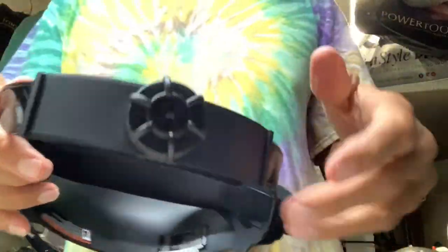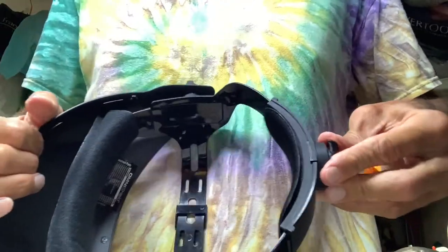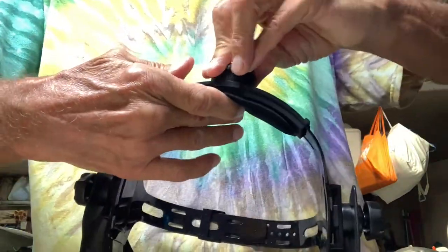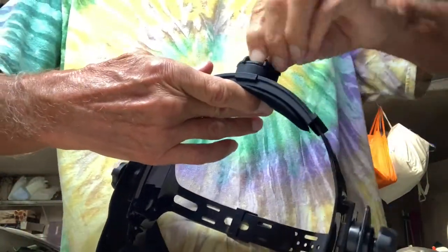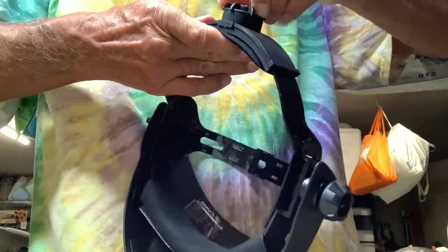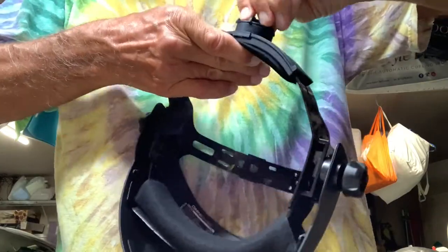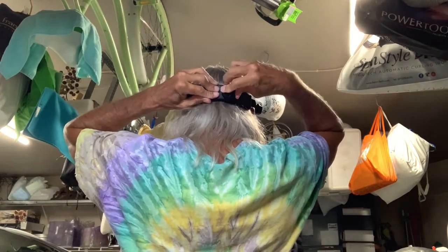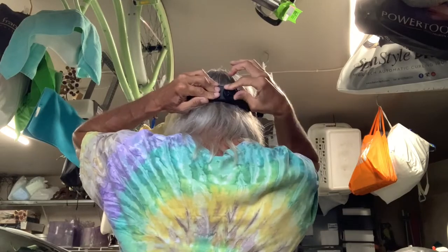Let me show you how this works. When you push it in, it goes in — see how it's going in? And then it goes out this way. So when you put it on your head, you twist it until it's tight. I'm going to loosen it, put it back on my head, push it, and tighten it until it feels right. Tighten it clockwise, loosen it counterclockwise.